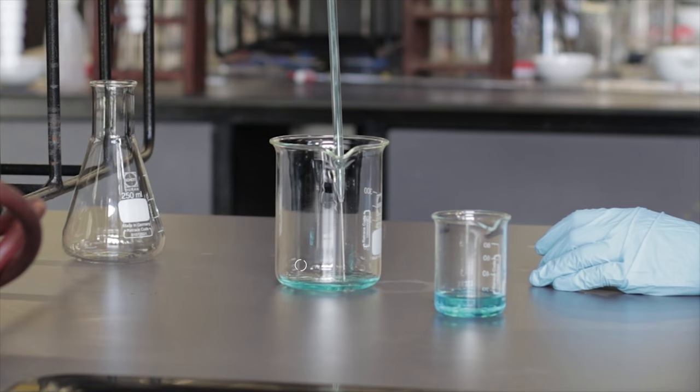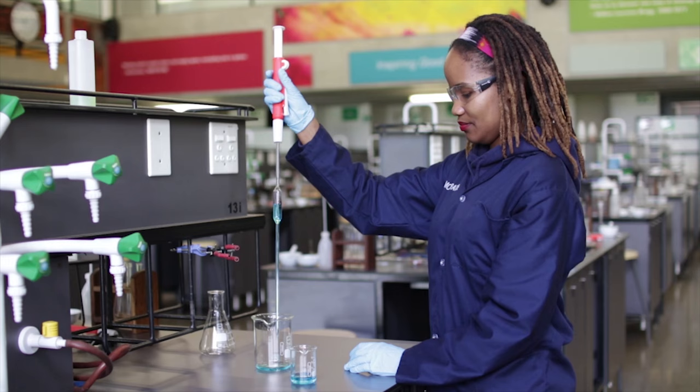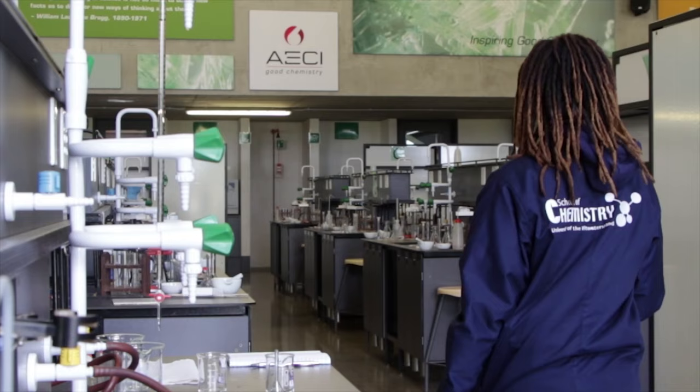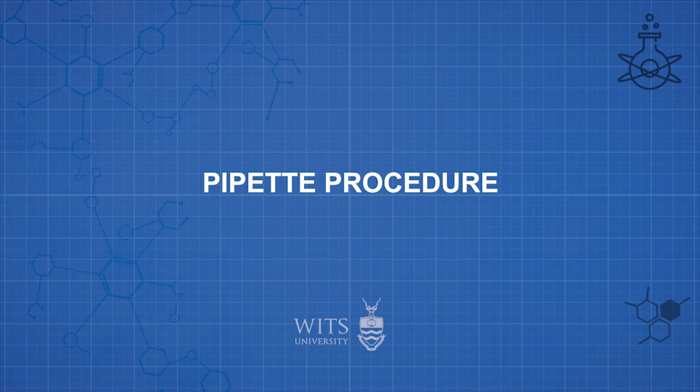We recommend that a beaker be placed on your bench for any chemicals that you will no longer use during your experiment, which we refer to as the waste beaker. At the end of your practical, the waste in your beaker will then be discarded in the waste bottles in the lab.